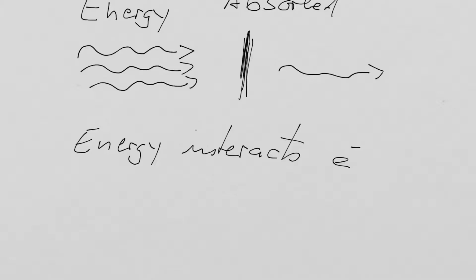Energy is released, and all of a sudden we see this energy as well. But that's a different story. This energy that is then released when the electrons fall down again after the push is called fluorescence. So when we talk about fluorescence, this is what happens. We excite the electrons in the first place and then let them fall down again.